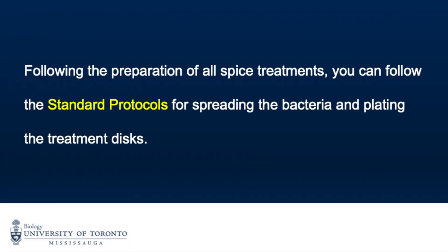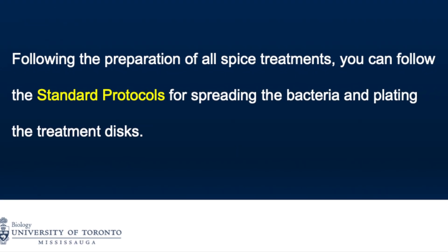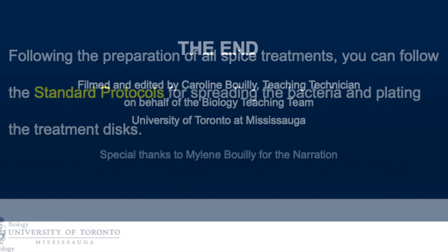Following the preparation of your spice treatments, you can follow the standard protocols for spreading the bacteria and plating the treatment disks. Thank you.